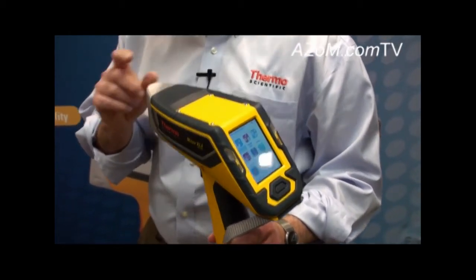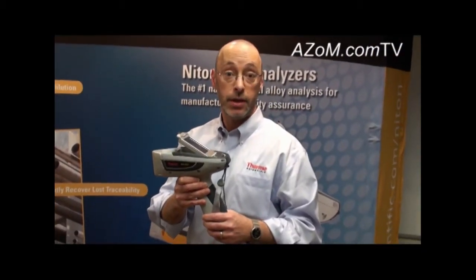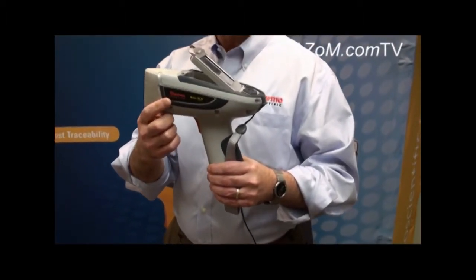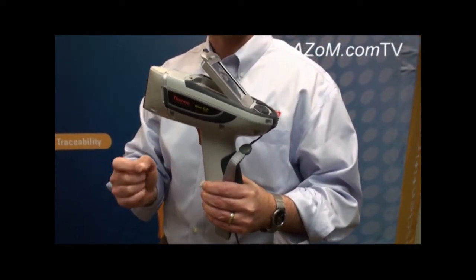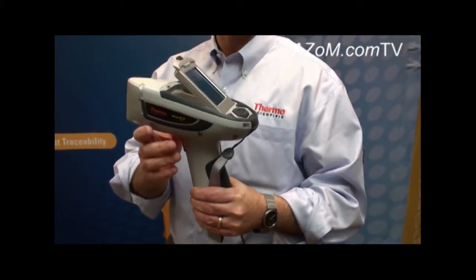The Niton XL2 complements our flagship XRF analyzer, the Niton XL3T. This is available with what we call GOLD Plus technology, which really takes GOLD technology to the next level, providing lower detection limits and even faster measurement times than the Niton XL2 with GOLD technology.